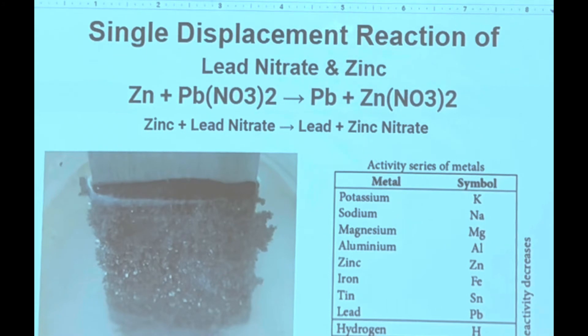Any metal on the activity series can replace the metals beneath them. So since zinc is higher than lead, lead nitrate becomes zinc nitrate and the lead grows on the outside of the zinc. Look at those amazing crystals.